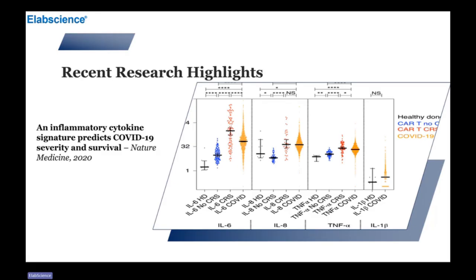When combined with complementary assays like Western blot or qPCR, it also provides both quantitative and mechanistic insights. Overall, ELISA continues to play a role in generating data that can translate from bench to bedside. So to conclude our session today, ELISA remains a cornerstone technique in translational research. Its ability to provide precise, quantifiable protein measurements across diverse samples bridges laboratory discoveries and clinical applications.